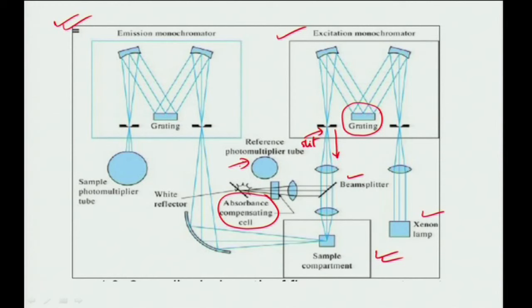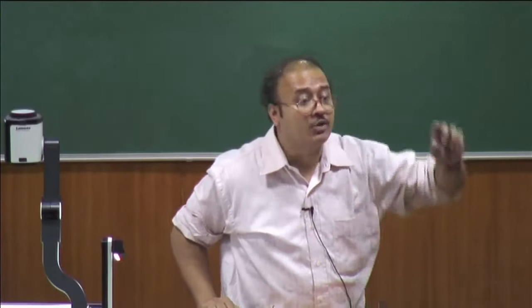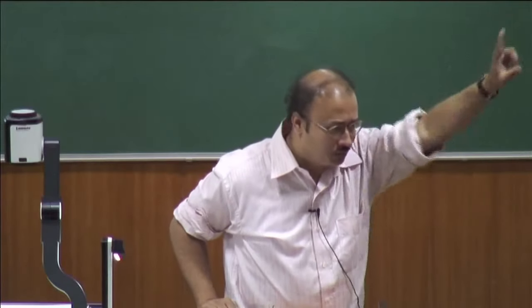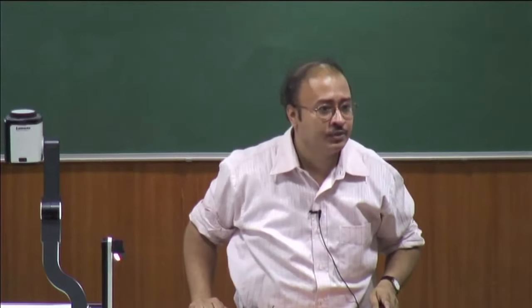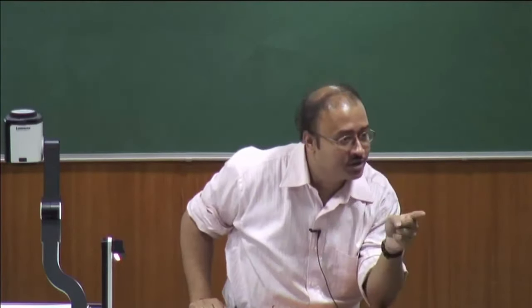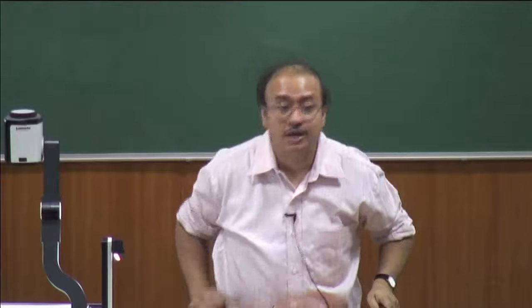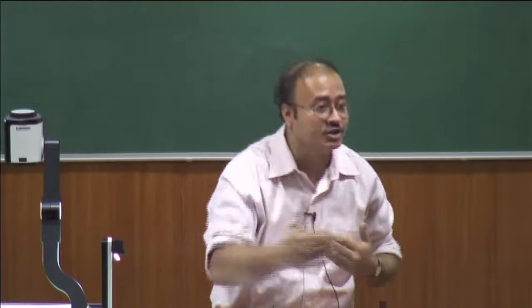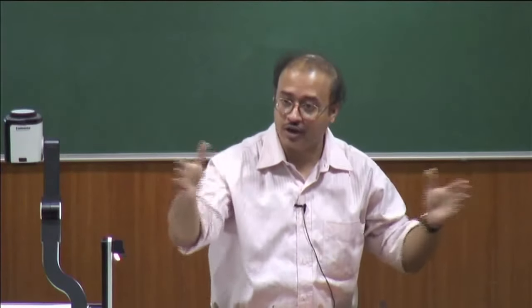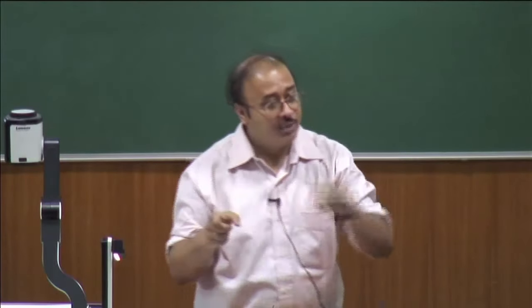And the reason is this, to be very short: if you are doing a fluorescence experiment, say for 10 hours, that is the time you need. You started with a certain intensity of light at, say, 5 minutes. Now, when you go to 500 minutes, there is no guarantee that the intensity would be exactly the same as what you started with. So, if you are doing a time consuming experiment, the intensity of the lamp has decayed as a function of time, because it is a very long experiment, and the fluorescence intensity would depend upon the excitation intensity.